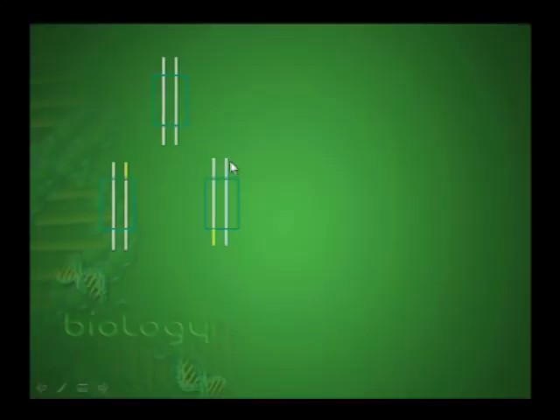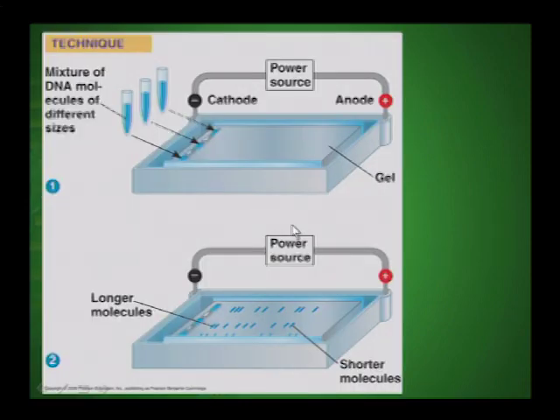We can run PCR, but what we would be targeting here is not just any gene. What we'd be interested in targeting would be VNTRs. So what we could do then is target specific VNTRs, and then produce primers on either side of those VNTRs, and we could make multiple copies of those specific VNTRs. And then, again, if we target several different VNTRs, we would be producing PCR fragments instead of restriction fragments, if you will. So then we could go ahead and load our samples into a gel. We could go ahead and run our gel.